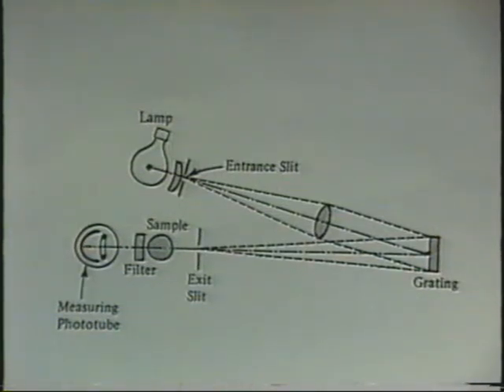For our copper analysis, we'll make solutions which are blue in color. Things which are blue strongly absorb yellow light. That's the complementary color of blue. So for our analysis, we'll use light of wavelength 625 nanometers, which is yellowish. Now, the more light absorbed, the more copper is present. Or in other words, the smaller the percent T, the more copper is present.